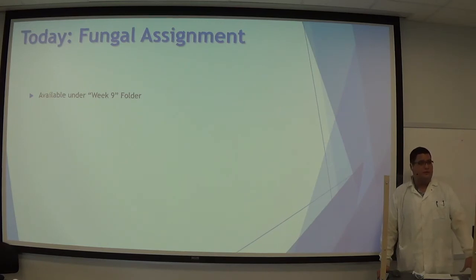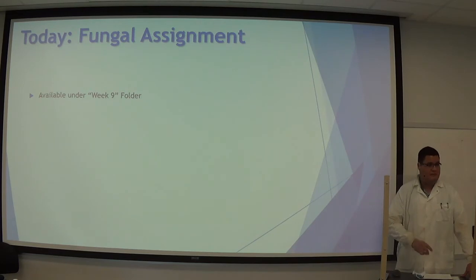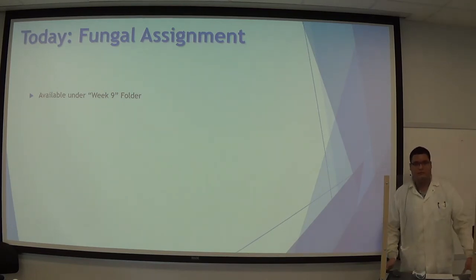So, for those of you that are here in person, I'm going to go around, because I have the answer key here to what all of your fungi are. You guys are going to draw and write down all your observations, and then you will grab one of these notebooks up here with all the different types of fungi on it and figure out which is which, and then I'll come around and sign your paper if you selected the correct one. And then after that you can either scan it or take a picture and upload it online with your assignment.